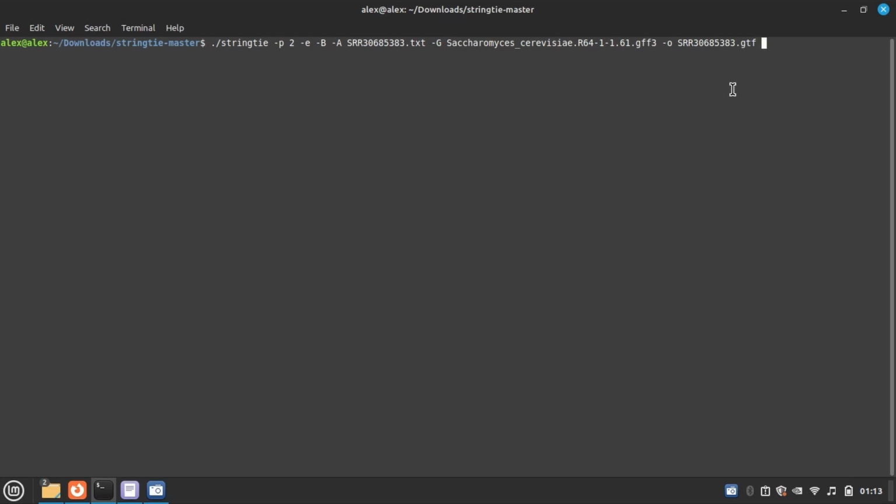And now you have to put the input file name. So the input file name will be this 83 accession 83.bam. So it is the total script. Then I'm going to press enter.